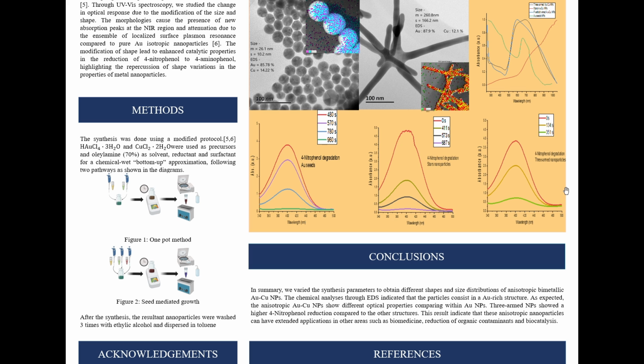After the synthesis was done, we washed the nanoparticles, because oleylamine makes the studies of these nanoparticles difficult, whether through ultraviolet-visible spectroscopy or transmission electron microscopy.